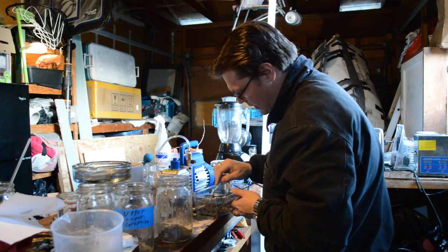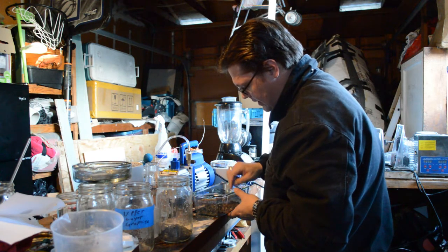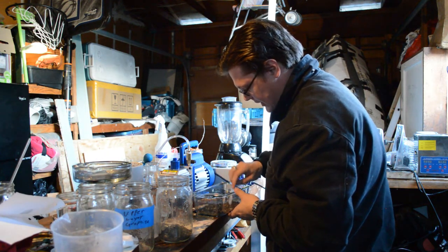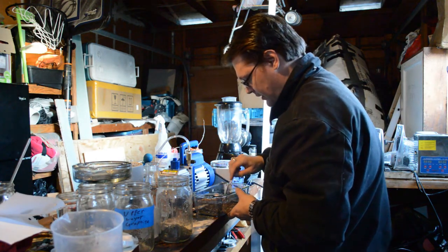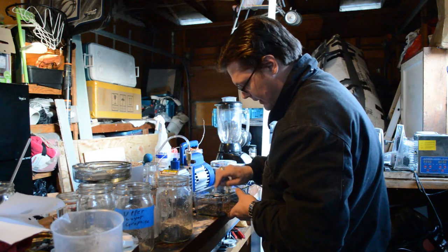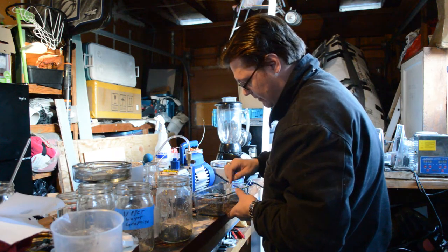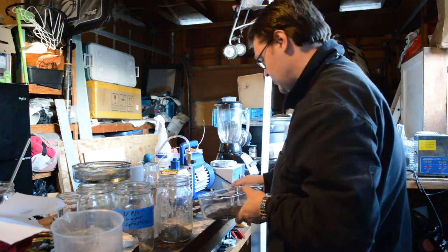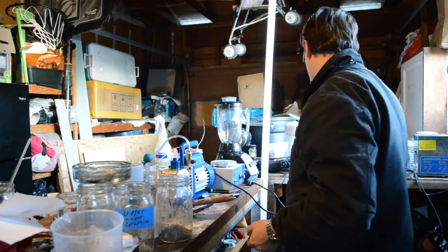So what I'm going to do with this stuff in later videos is I'm going to be making electrodes. At some point I'll be doing solar cells with high-density capacitors, batteries, all sorts of really cool things. If you guys stay tuned on my videos, I will go into detail on how a lot of this happens. In fact, probably after I get done doing this part of the video, I am probably going to do a short video on exactly what I'm talking about when I'm talking about re-intercalation. Now, I'm always going to be referring to these guys — Robert Murray Smith and Ace, and there's a few others. I'm going to have to go through the videos again and figure out their names, as some of them I just learned of.